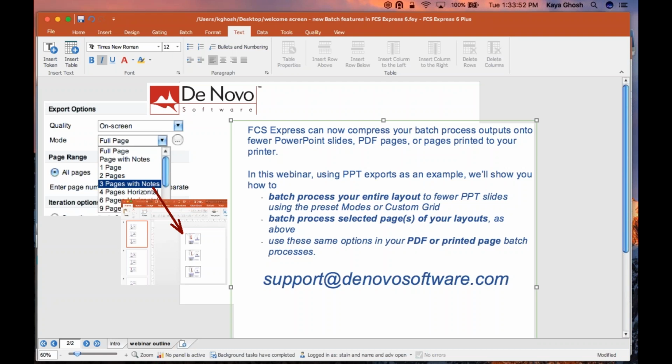I do see there is one question. Is there an ideal number of batch process actions? Oh, I see that Andrea already answered that. Okay, well, if you are running into some issues, just let us know what the problem was, and I'm sure we can help you troubleshoot that on a meeting.